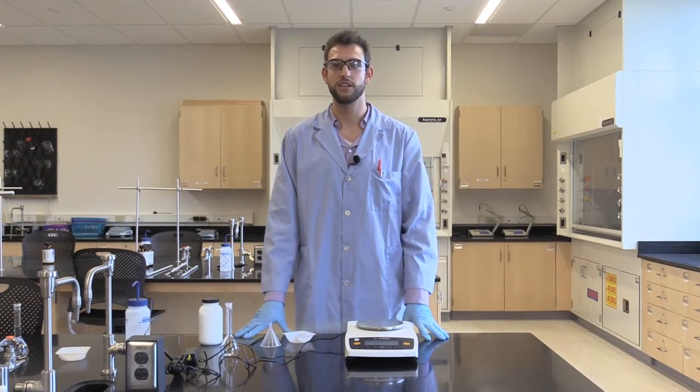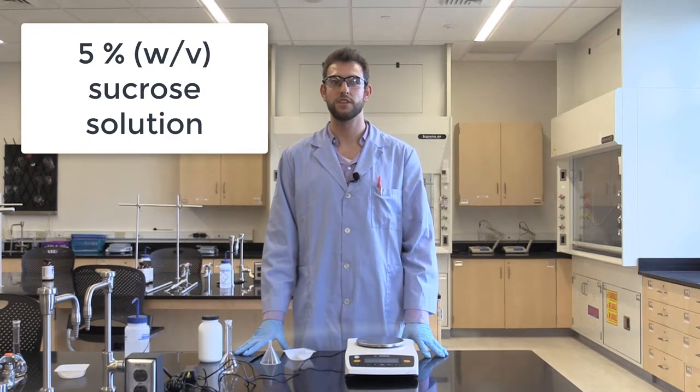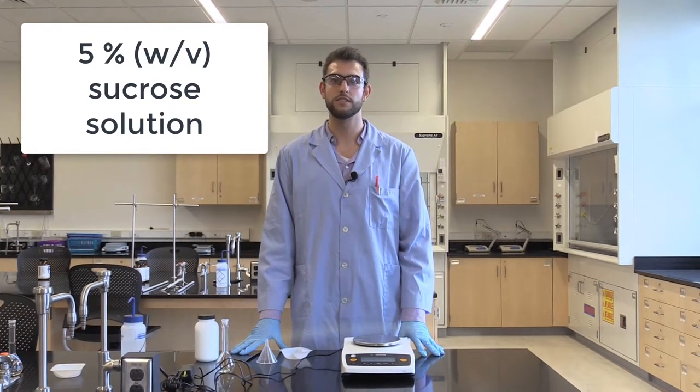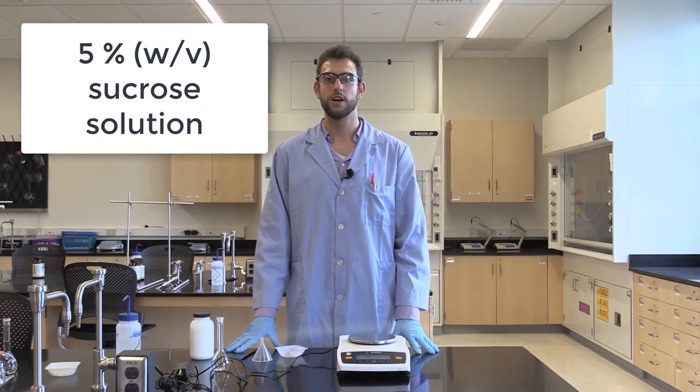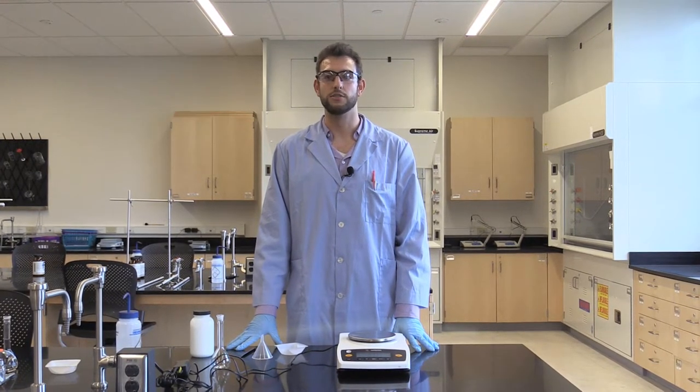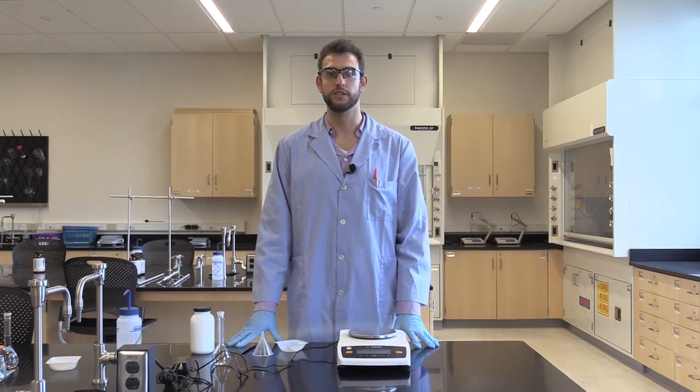Hi, my name is Dr. Scott Malidio, and in today's video I'll be showing you how to make a 5% weight per volume sucrose solution. What that means is I'll be weighing out 5 grams of sucrose and then dissolving it into a total volume of 100 milliliters.